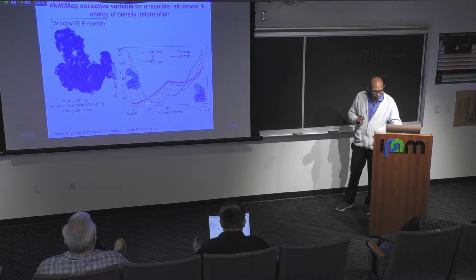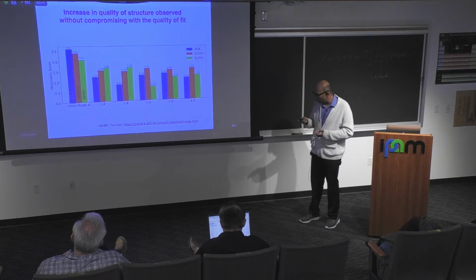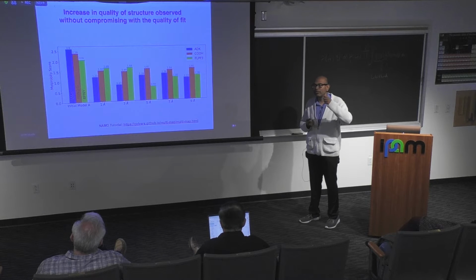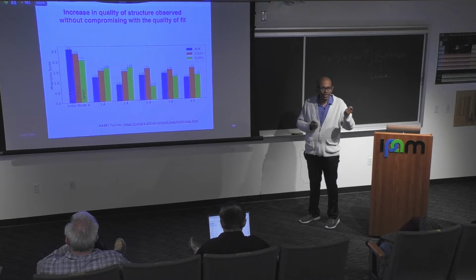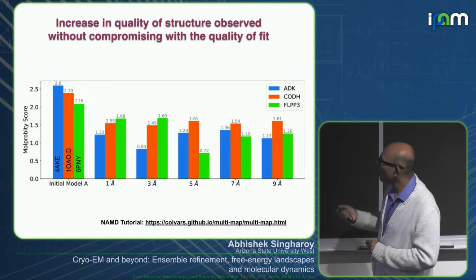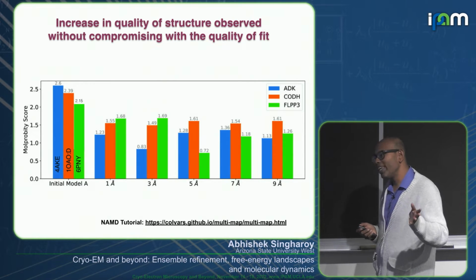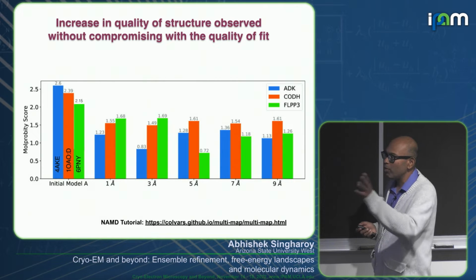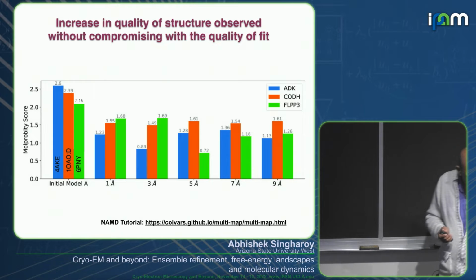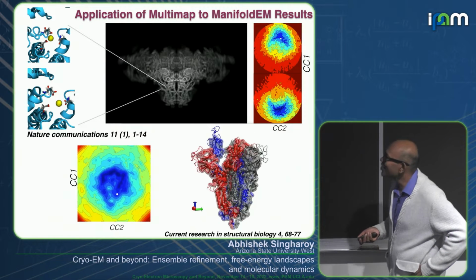The other thing is now you can look into things like MolProbity scores. All the fighting between the atoms that was created by that bad, erroneous term is gone. So the structures become better, and we are hoping to do a whole PDB analysis of this to see if we can actually make all the structures in the PDB better by defining them using density as a collective variable. But fine, so this is okay. The next thing is, now let's try to address the elephant in the room.